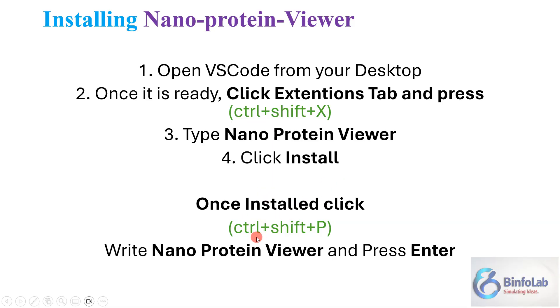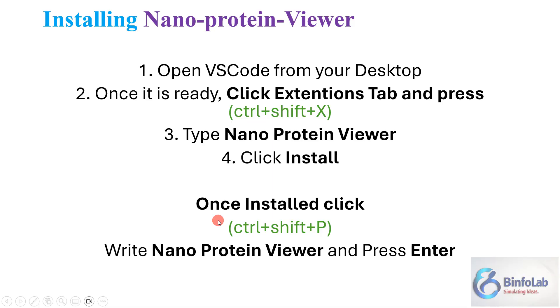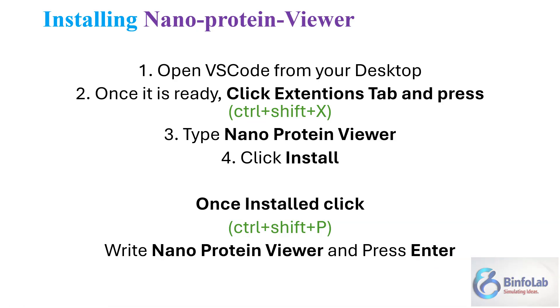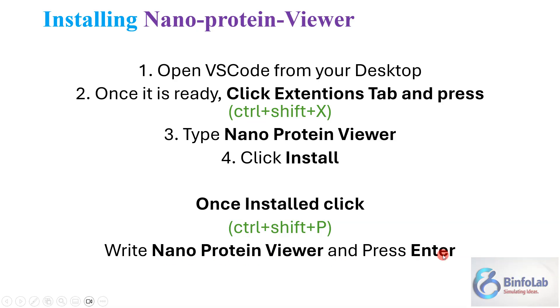Once you click these three buttons, a smaller window on the top will appear like a search window. Now type nano protein viewer there and click enter. After some time you will see that a nano protein viewer extension will appear and it will say install. Don't forget to press enter - that happens to me many times.